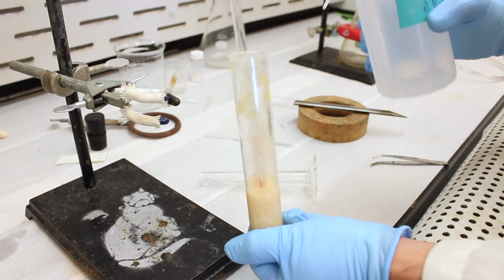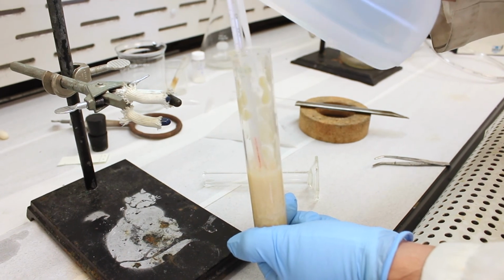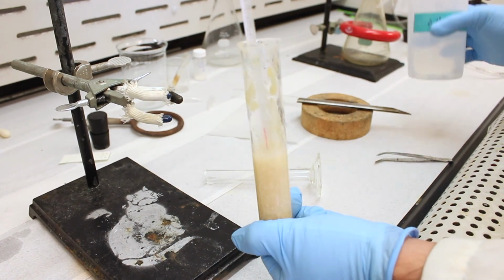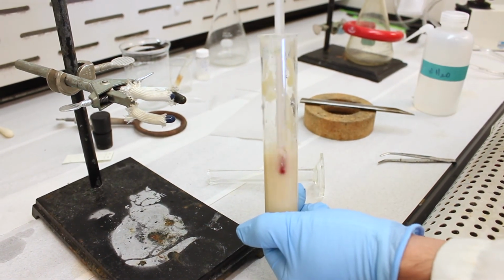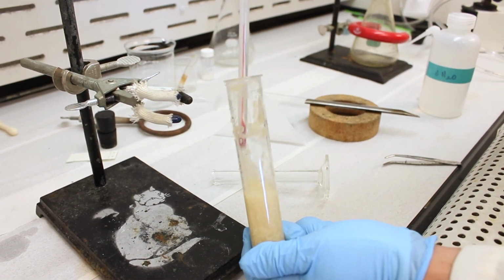Okay, let me add a little more water. It seems like there's a lot of goo. If we add extra water, it shouldn't matter. The product isn't soluble in water, so we're using it to dissolve the solvent.